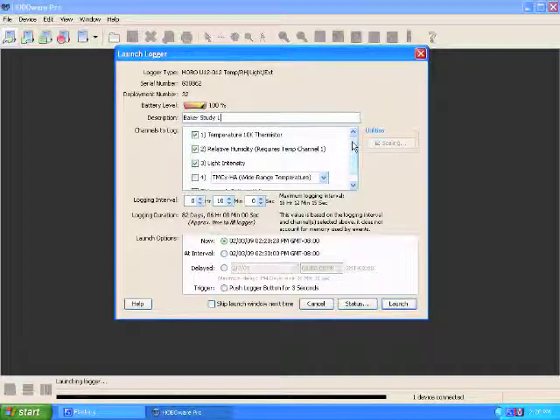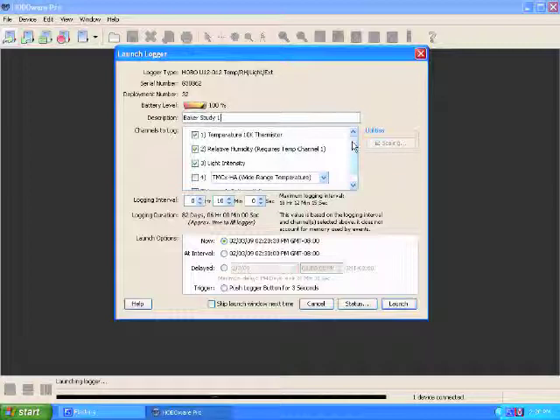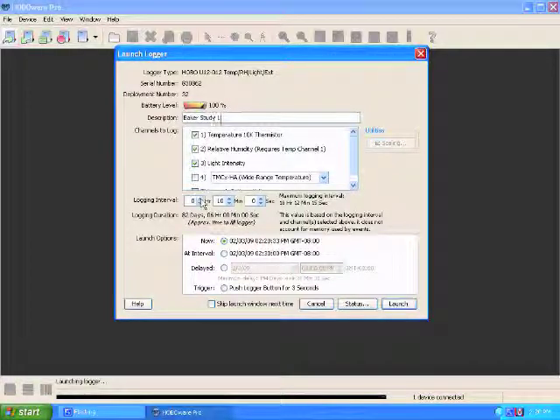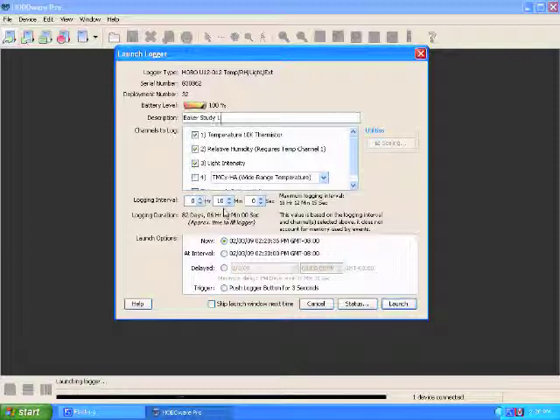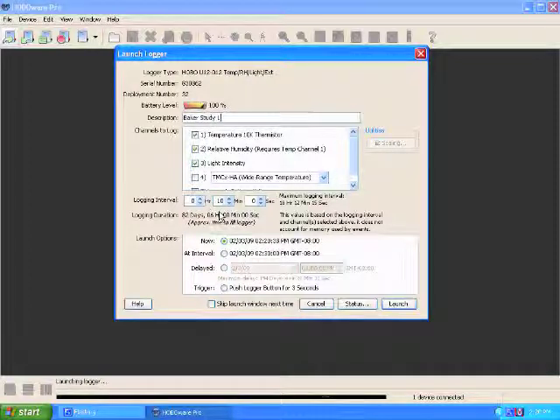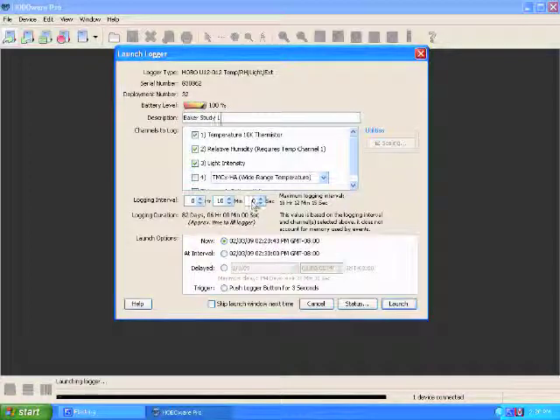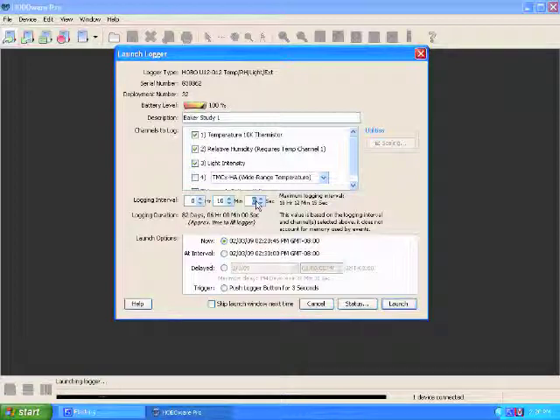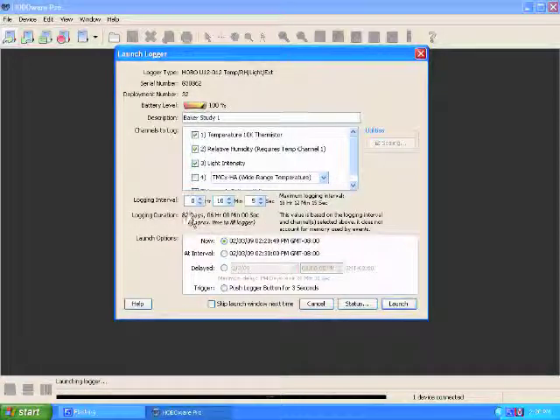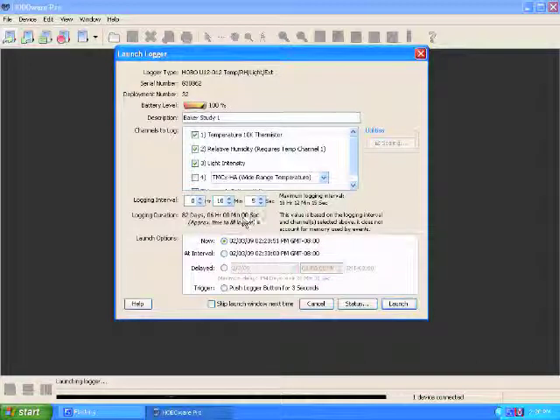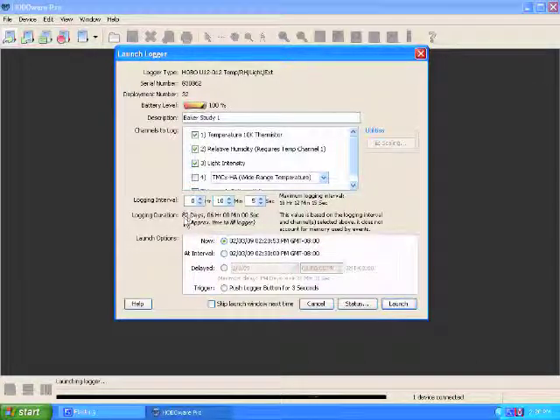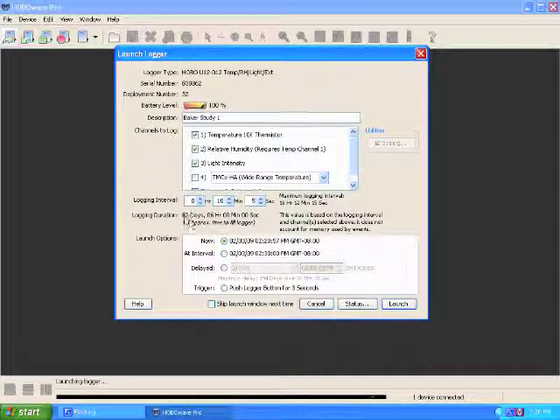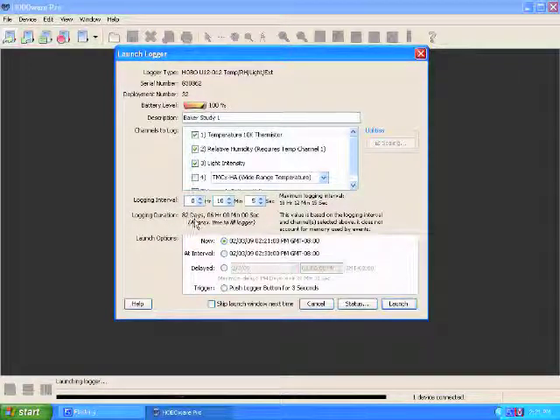Next, choose your logging interval. This can be anywhere from several hours all the way down to half a second. I'm going to choose mine to log every five seconds. This readout here tells you how long your logger can continue to take data if you have this logging interval. So right now, this can log for 82 days, six hours, before the internal memory on the logger is filled up.